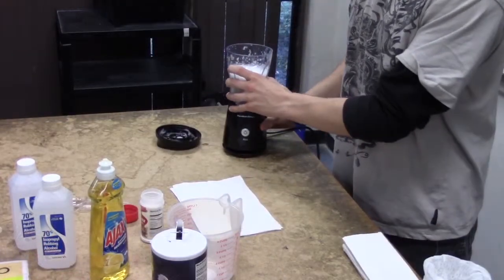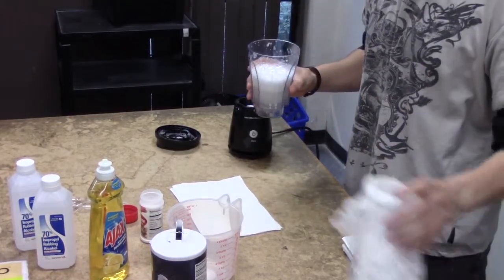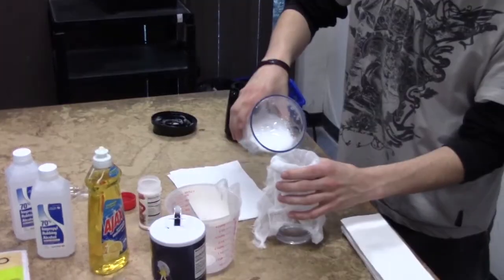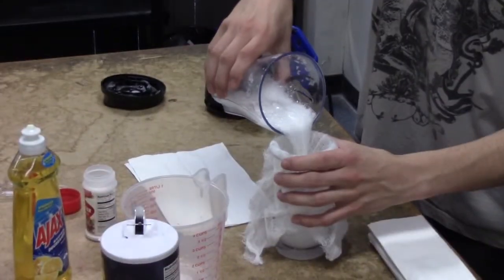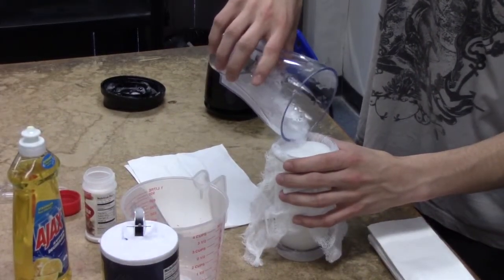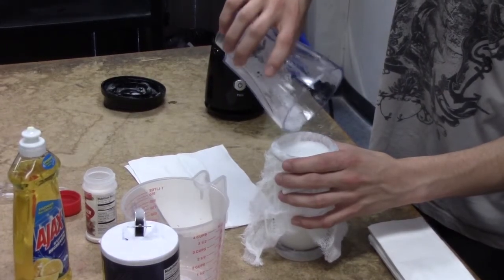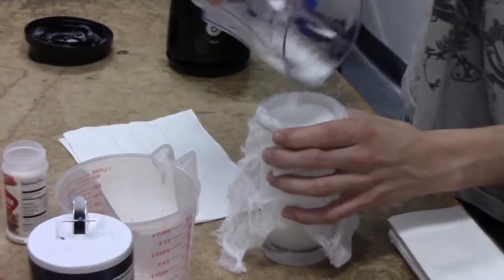Now that we have a good amount of onion pulp, we're going to pour it through our cheesecloth filter and into the cup. Make sure to get all of it in there. Good.